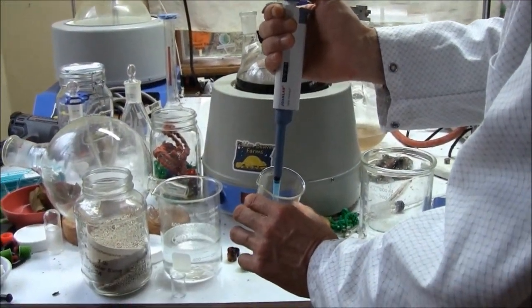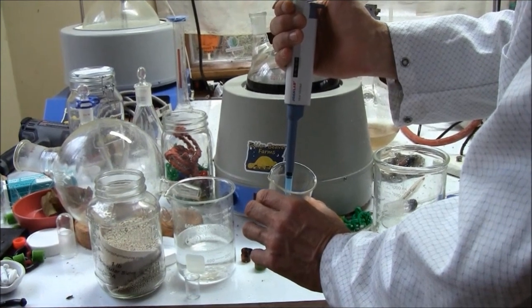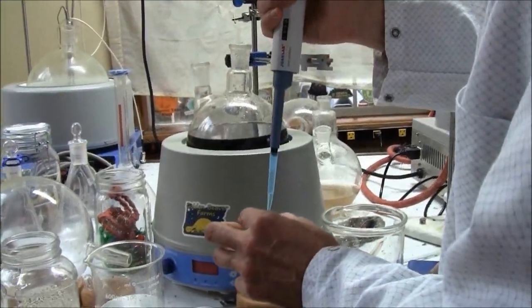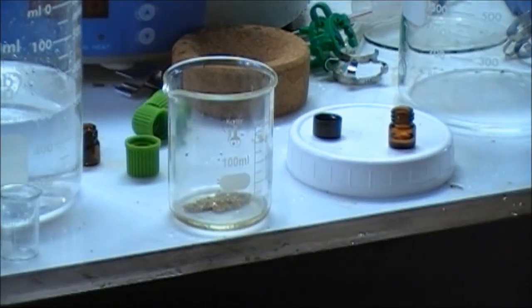So now I'm going to grab my auto pipette. So I've got it set to 1 mil. There we have it.